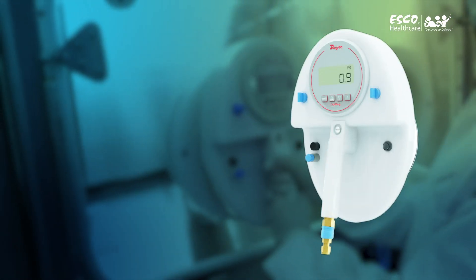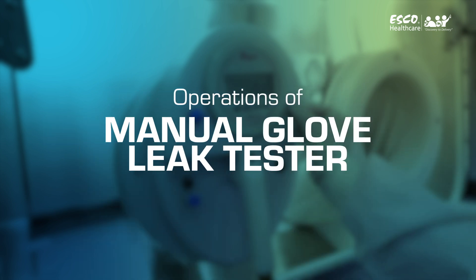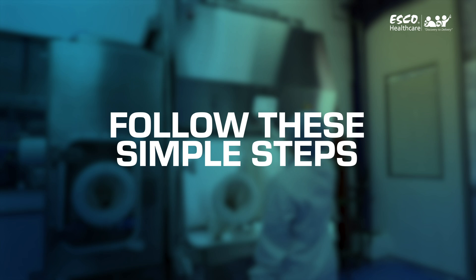Operation is a breeze with our user-friendly interface. Let's delve into the intuitive operation of the Manual Glove Leak Tester. Follow these simple steps for a seamless testing experience.